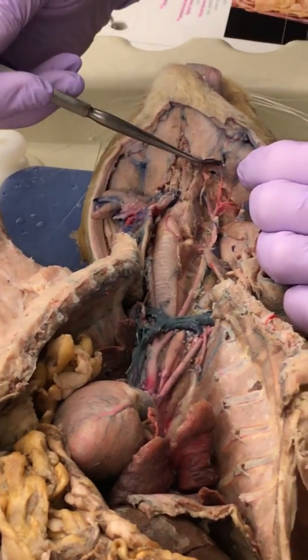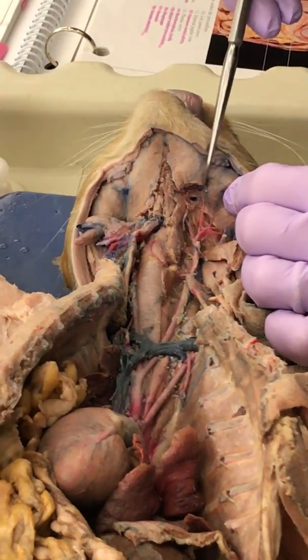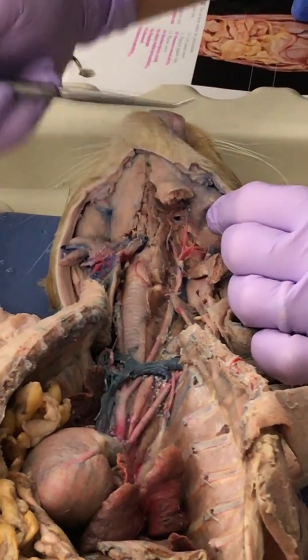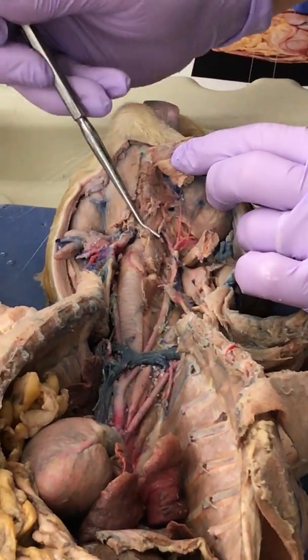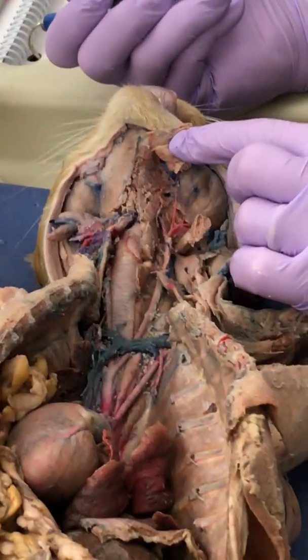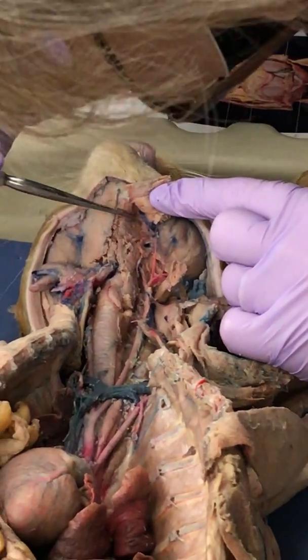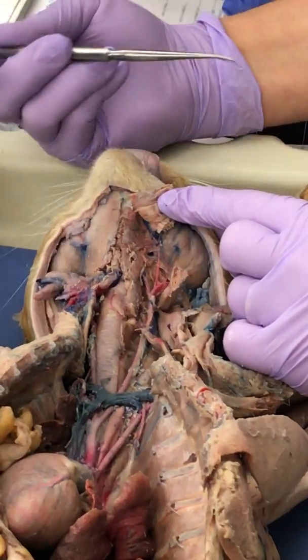Okay, then, I don't know if you'll be able to see this view, 'cause I can't even see it, but I see a labial coming right here. Oh, okay. Yeah, you can see it. But I don't know, let me push this back. Oh, yeah, submental. Oh, you got a good view there? Yep. So this one is the submental. The one going up. Yep. Yeah, you got a good one. Submental. That's the one I couldn't find anywhere.